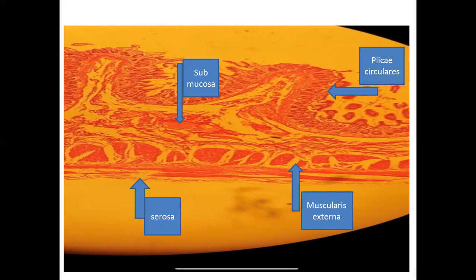Okay. زين، هذه هي السلايد للجوجينوم. هذه هي plica circularis with the villi اللي طالعة من هي الفيلاي. اوكي، يعني including from mucosa. وهاي منها هذه هي طبقة السبميوكوزا and its characterized absence of the Brunner or any glands. اوكي، وهذه واصلة لحد الcore of the plica circularis.